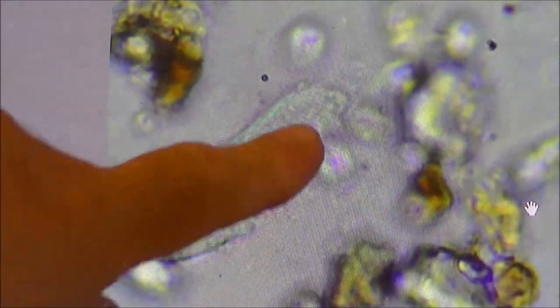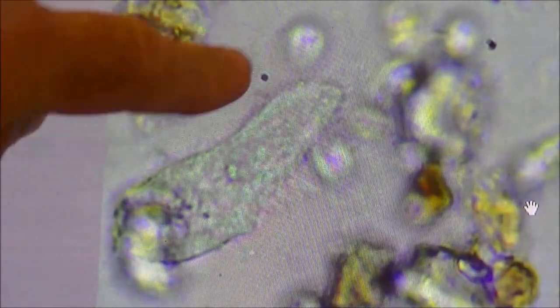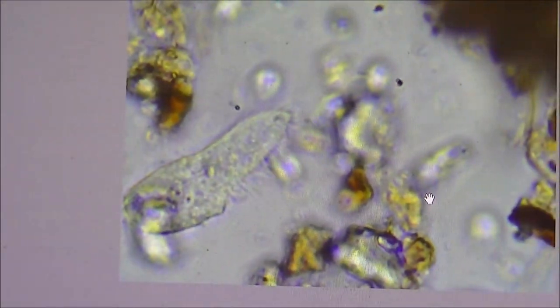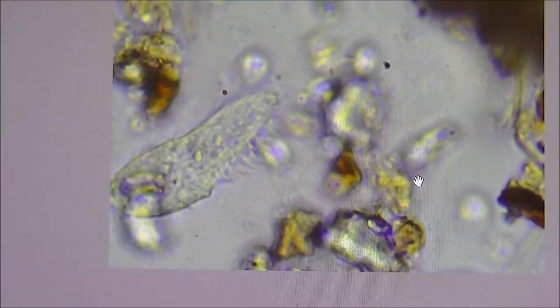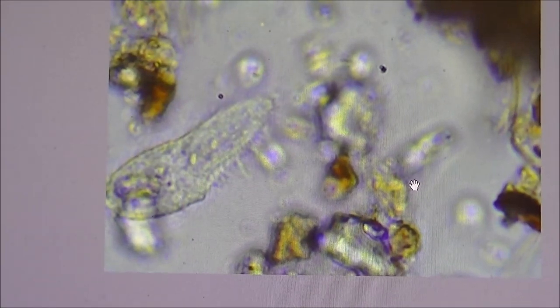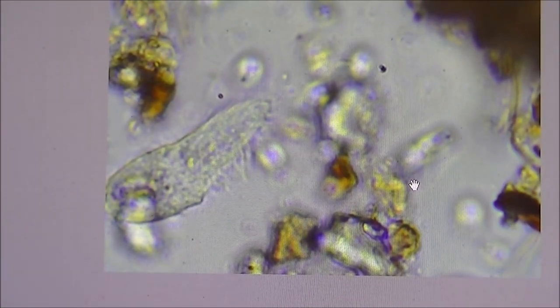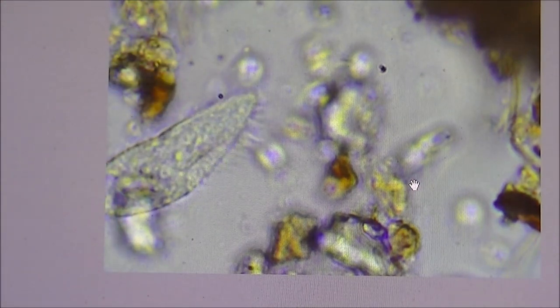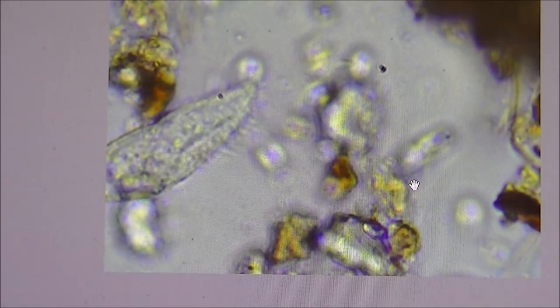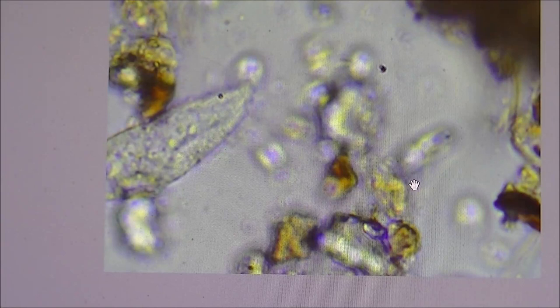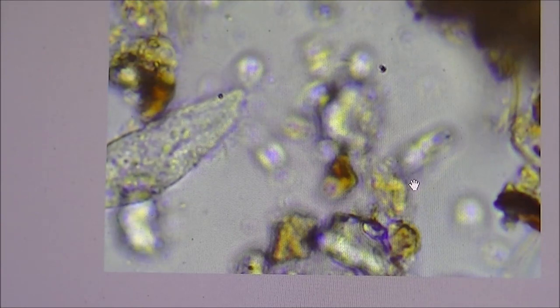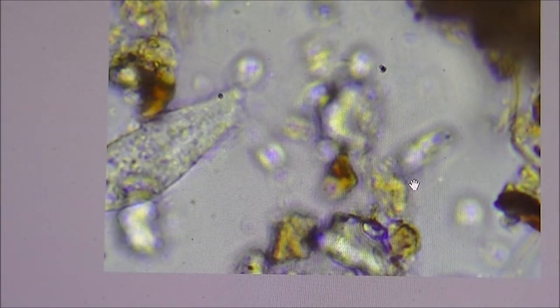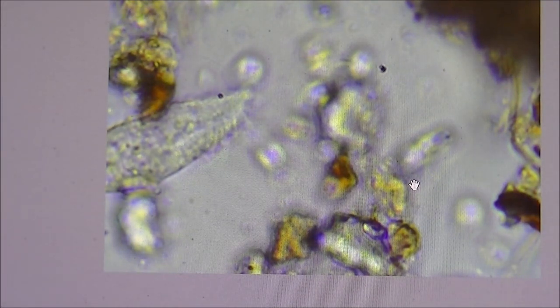You can see the size of this compared to the little bacteria in the background. This is why you wish to build soil aggregates in your soil, so this can move around and eat the bacteria. You want your soil open and aerated and also have that fungi, the mycorrhizal fungi in there, to open it up. It makes highways so this can swim around because this is so big. How can it move between those soil particles if those soil particles are compact?